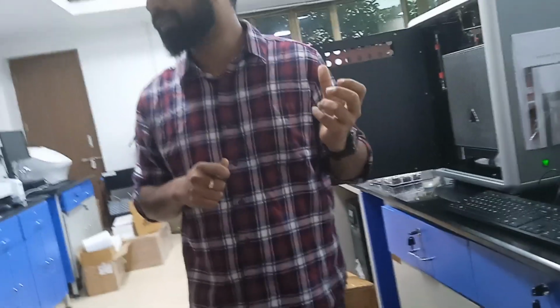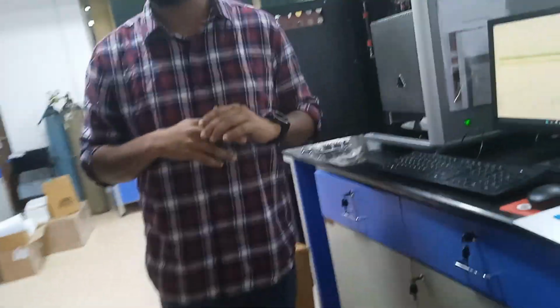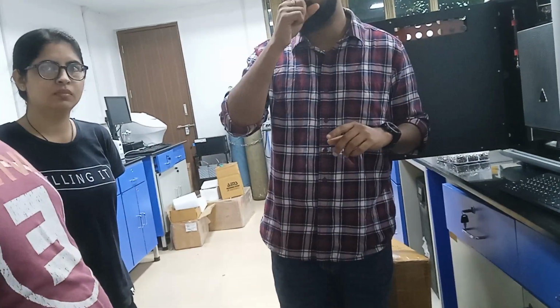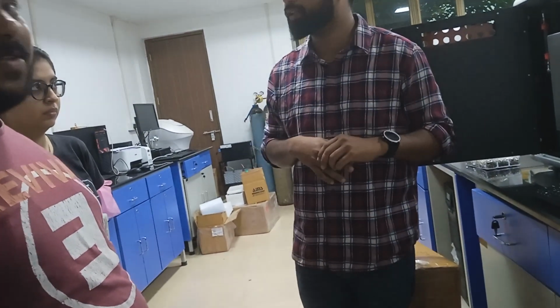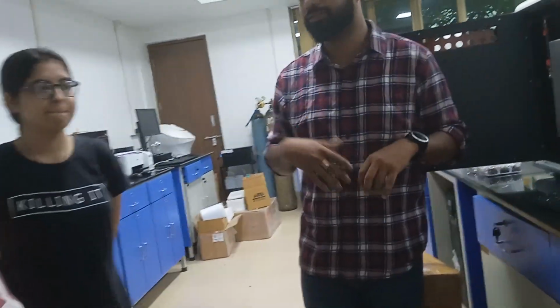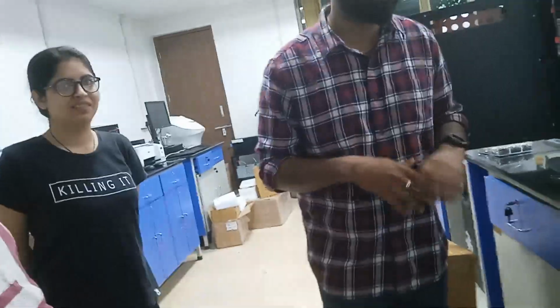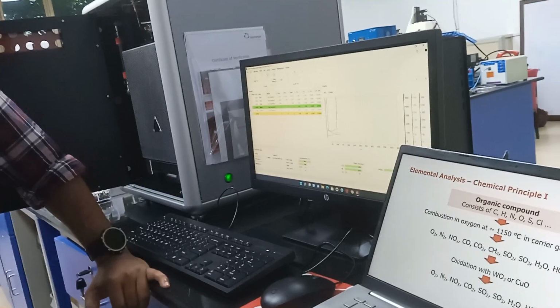The glass tube is costly because it is pure quartz. In 2016, quartz tubes this size were around 14,000. Now if you are procuring with us, it is almost 25 plus, excluding GST. If it is not 30,000, then it is not pure quartz; we have cuvettes. So be careful, or else for the first 2 times you call the engineer, better to see how it's going.